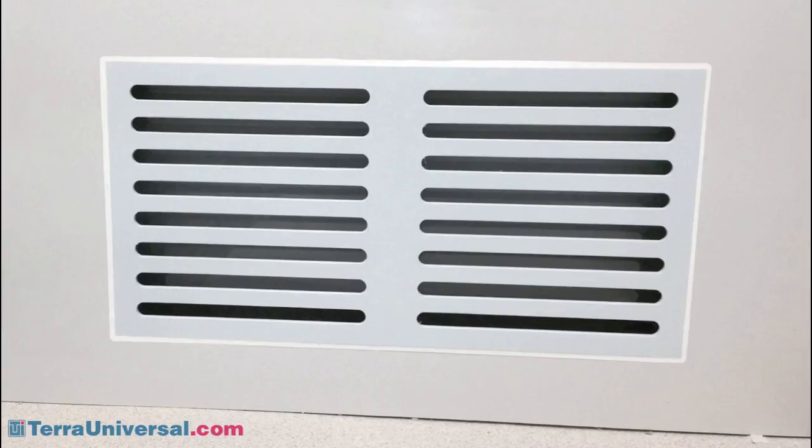This process results in a completely sealed clean room that meets ISO cleanliness standards and is easy to wipe down and sterilize.